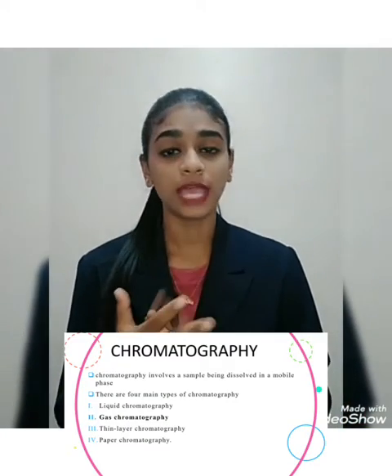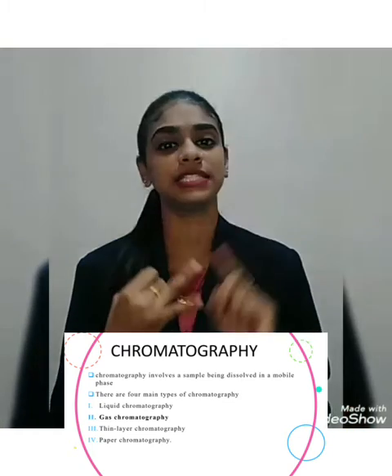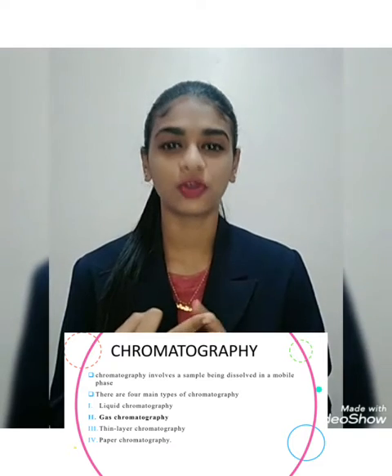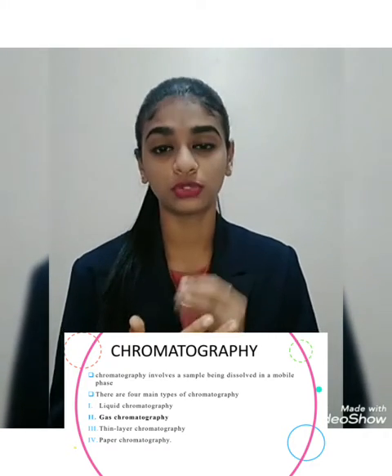Basically, there are four types of chromatography. The first one is liquid chromatography, and the second one is gas chromatography. The third one is thin layer chromatography, and the last one, the fourth one, is paper chromatography. Here in this slide, I have highlighted the word gas chromatography. Why? Because as I told before, today our main topic is about gas chromatography.